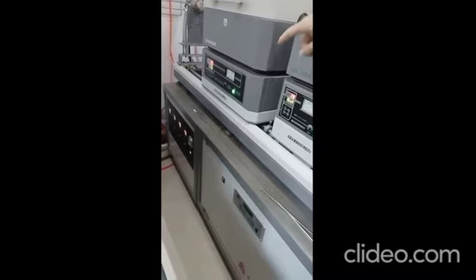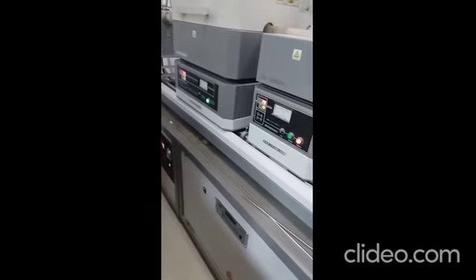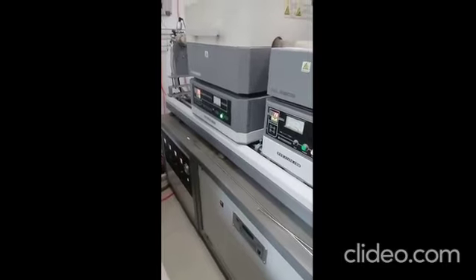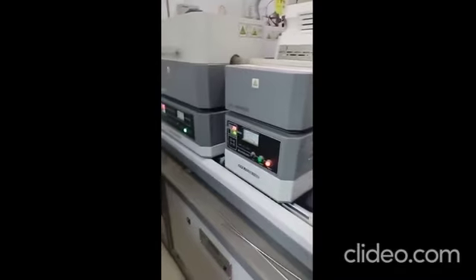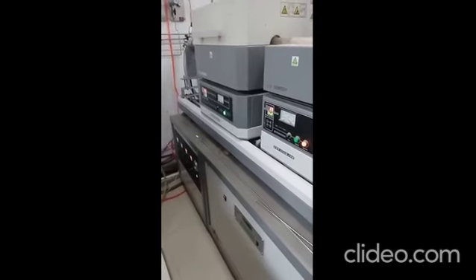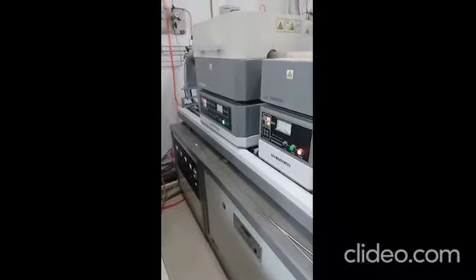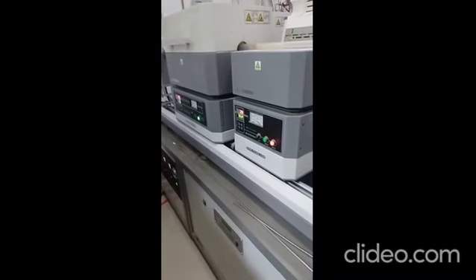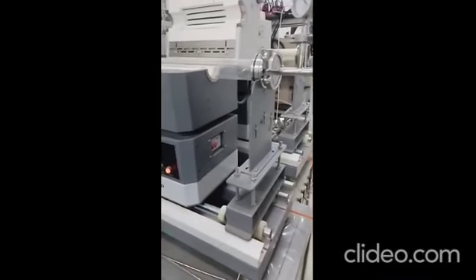We turn on the CH4 valve after 1 hour, after 1100. For how much time? About half hour. Okay. And then we turn off and let it cool to room temperature. And then we can take out the sample.